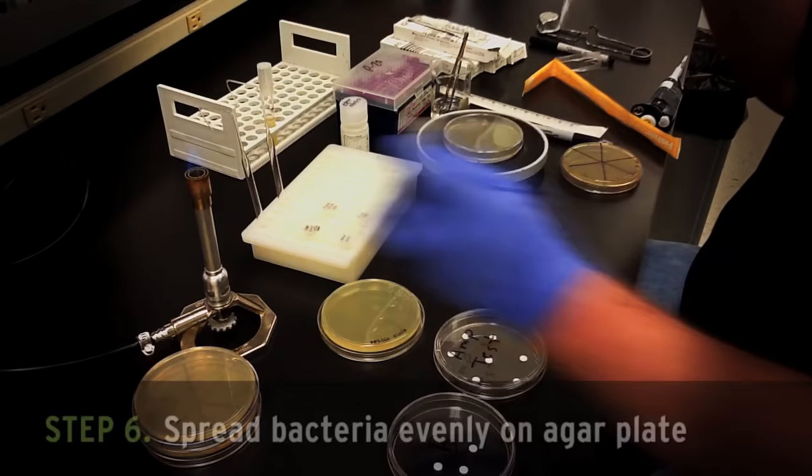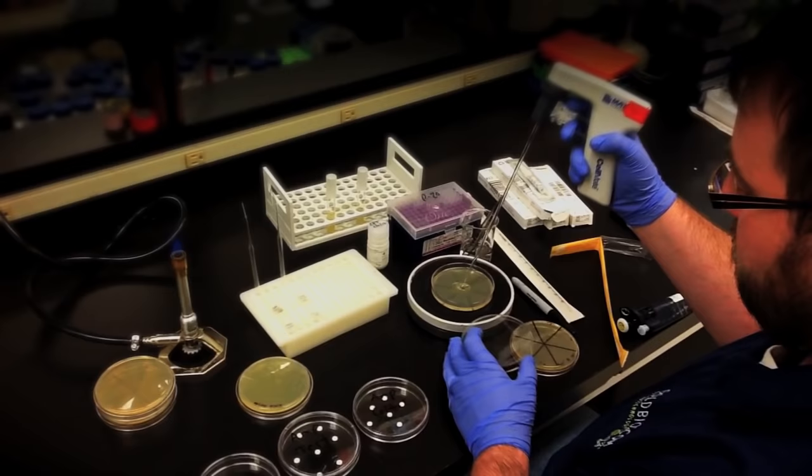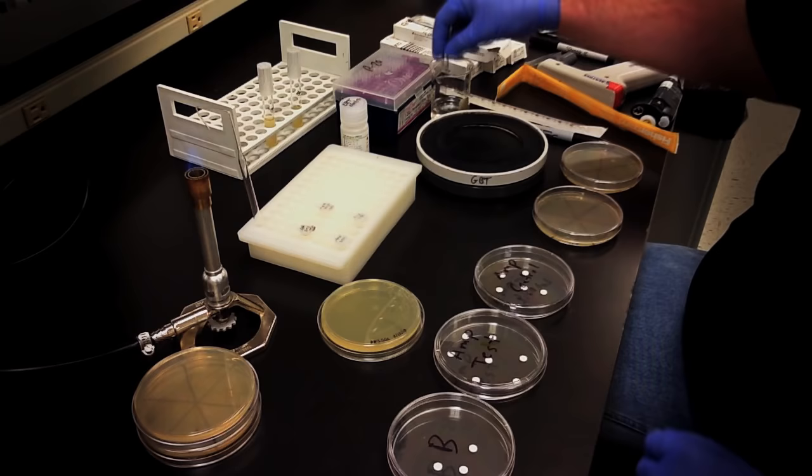Once your cultures have reached the correct density, we're going to plate around 200 microliters onto each plate. Make sure to spread the bacteria evenly so that all areas are covered. Once there's no visible liquid on the plate, you're ready to place your discs.